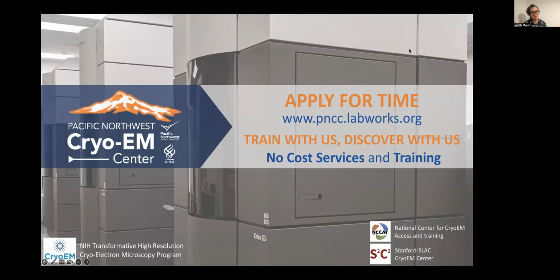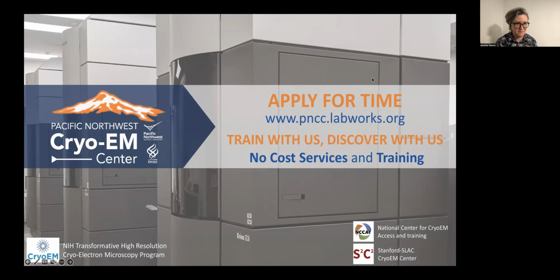I'm Jeanette, a microscopist at the Pacific Northwest Cryo-EM Center, or PNCC for short. Just a quick intro to what we offer. We have 2 types of proposals. One of them is our screening access proposal, which would let you come on site with us for up to 5 days of sample preparation and screening with staff assistants.